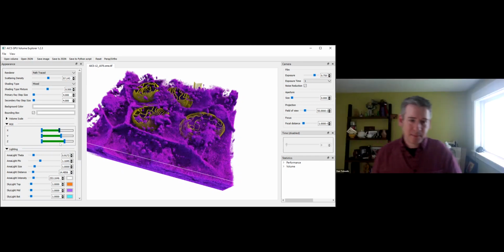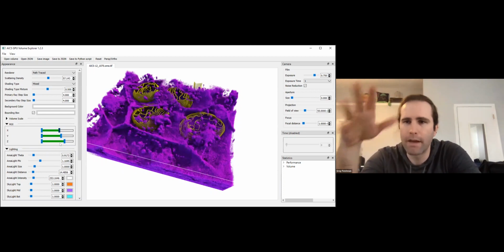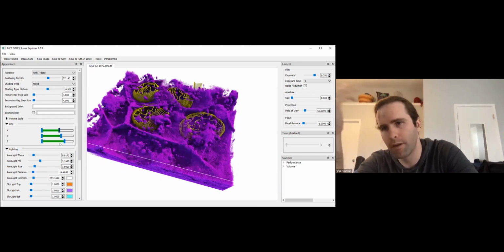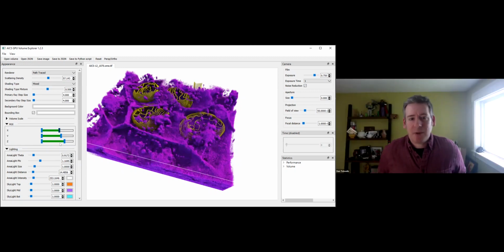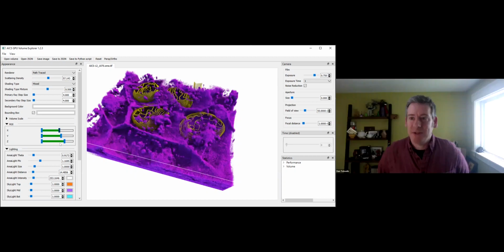That would be, for me, the ideal way of getting the data into the client, instead of having to write it out as a multi-channel TIFF and then open it myself. Yeah, that's exactly right. And I would just say, stay tuned. That may show up sooner than later. We're starting to prototype things along those lines.